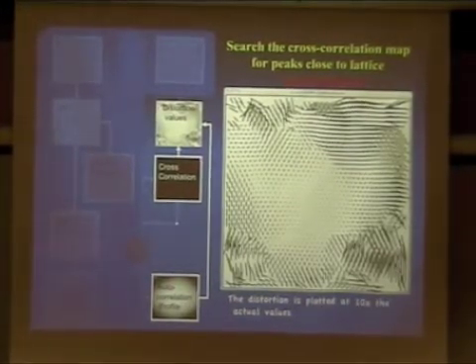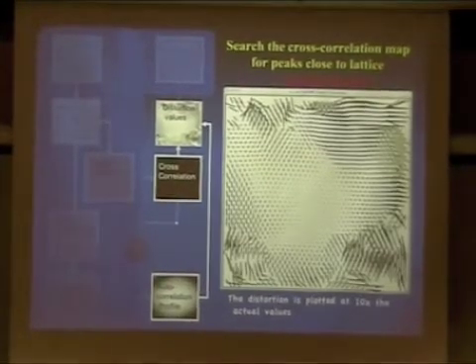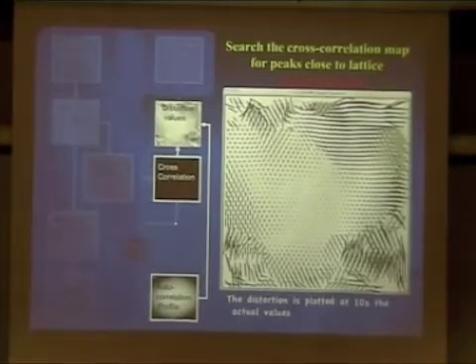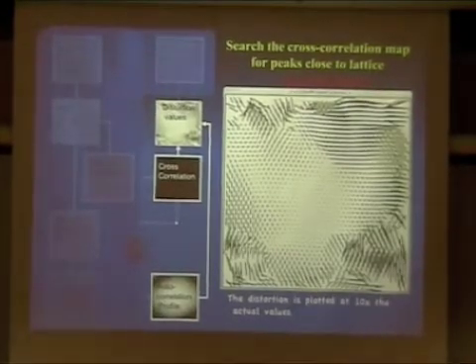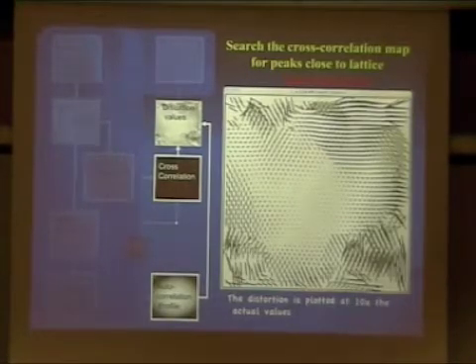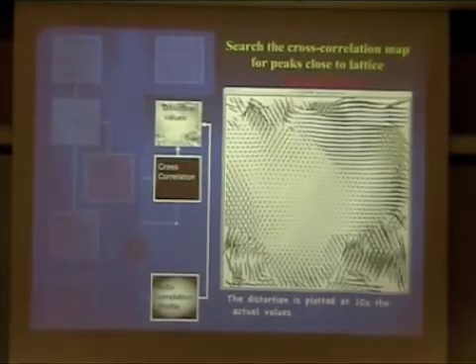A quick and easy solution to that which we occasionally use: if you have a large crystal with one very obvious dislocation or several, you can polygonally mask out one region and do the individual processing as though they were separate images, and then merge them together later. It's not perfect, but you have to do some handling. For those kinds of things, you just have to process them separately in different patches.